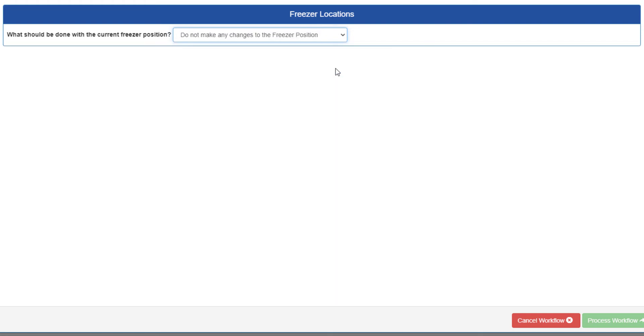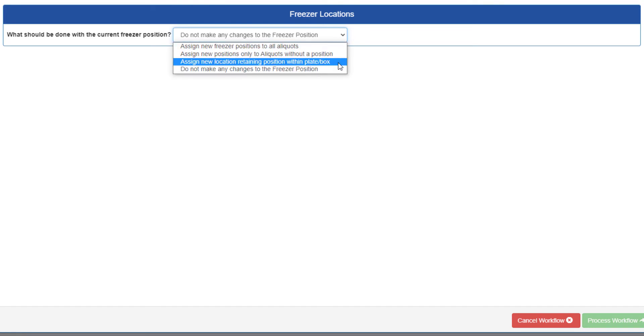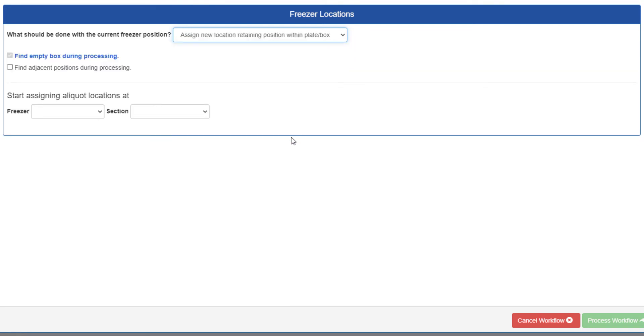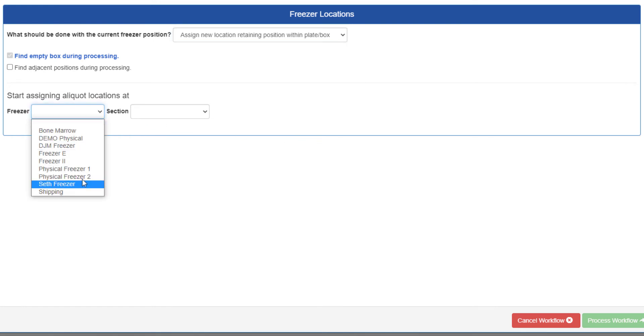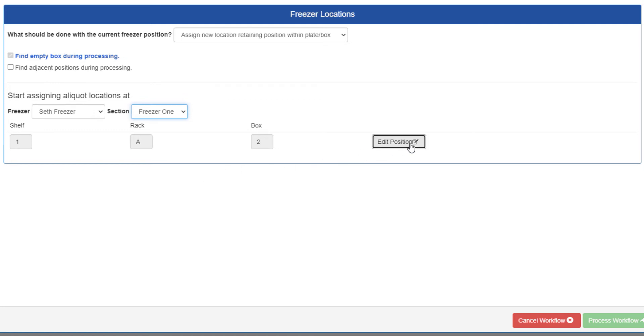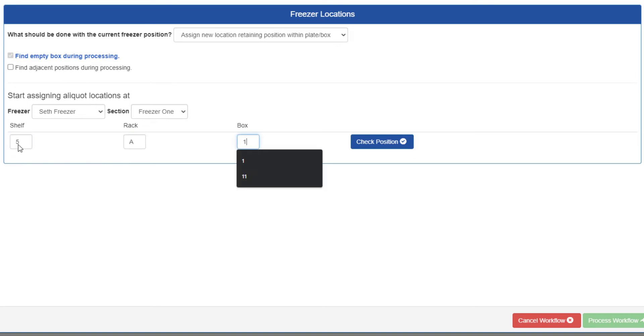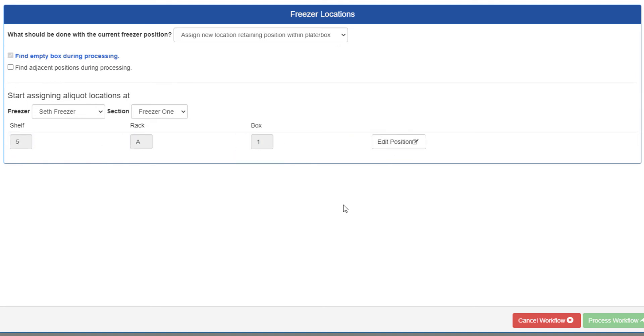But if you recall, I'm checking in aliquots with retained position info, so we need to select that option. Then we assign positions like normal. Select a freezer and section, and the location fields will appear with the next assignable position automatically entered. If you'd like to edit these fields, click edit position. Remember that the last two subdivisions, related to the aliquots actual positions, will not be available. These are still retained by each of the aliquots.